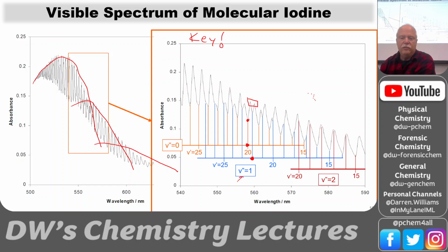This is the weird region, and I know, if I wasn't following this key, I wouldn't believe it either. So you just have to go with what the key says. Here we have three series overlapping, and this peak 15 is really, really small. So it's like this little band head like this.